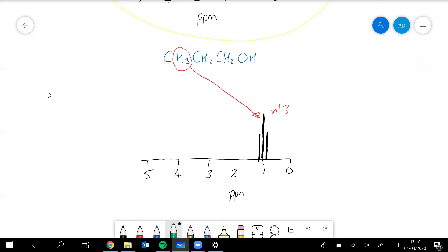Let's have a think about these two here. That's a bit more complicated. There's two of them, integrated value of two. But the carbon has got, it's attached to two carbons. That carbon has got two hydrogens attached, that one's got three hydrogens attached. That's five altogether.